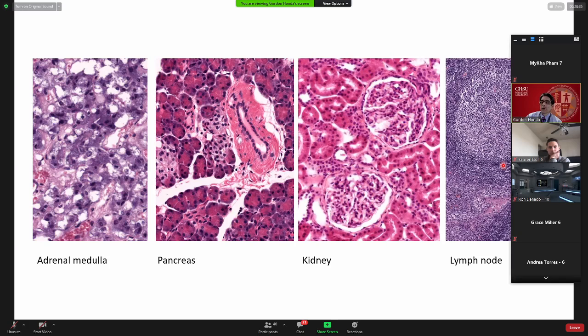Lymphocytes have a lot of chromatin. That's why overall it looks purple. And it's full of these tiny dots because lymphocytes tend to be small. This is a germinal center. Germinal center, it's a little bit lighter because the bigger lymphocytes tend to hang out in the center. And this is where they're processing all those antigens. It's really a busy area here. So you should be able to recognize the lymph node at low power.